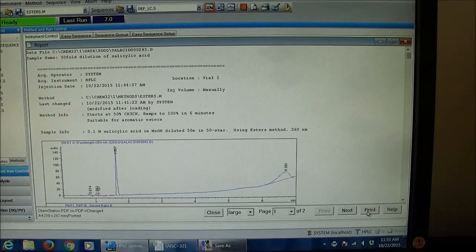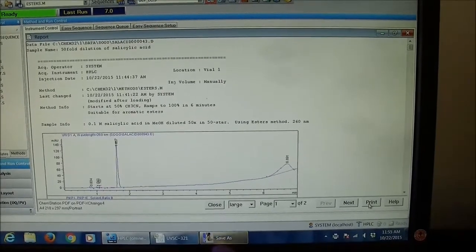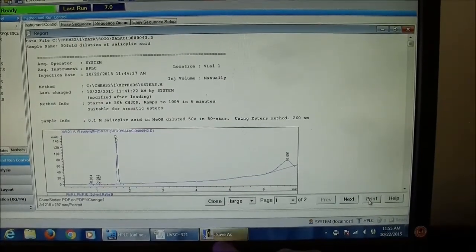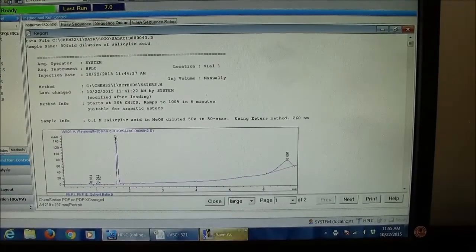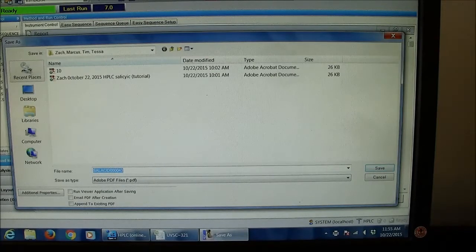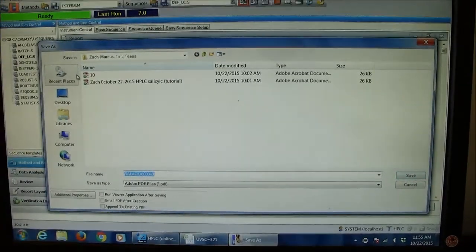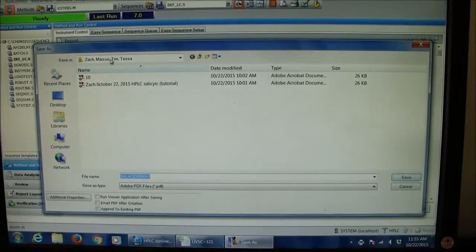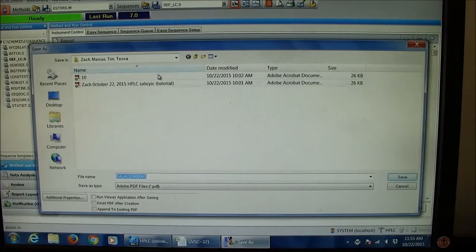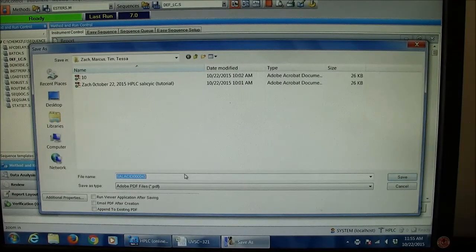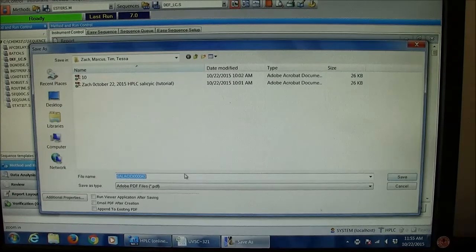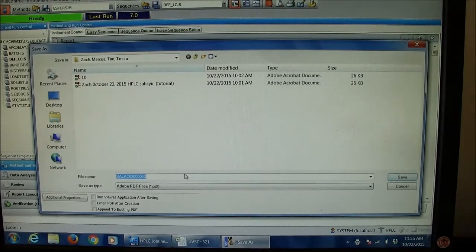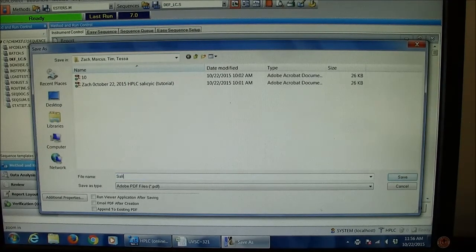It should come up with this ChemStation PDF here on the bottom. If I click save as, in this case, this is coming up as Zach, Marcus, Tim and Tessa's folder in the Dropbox. I'll give it a good title: Salicylic acid control.